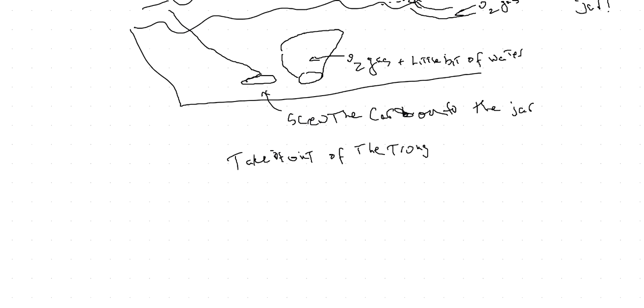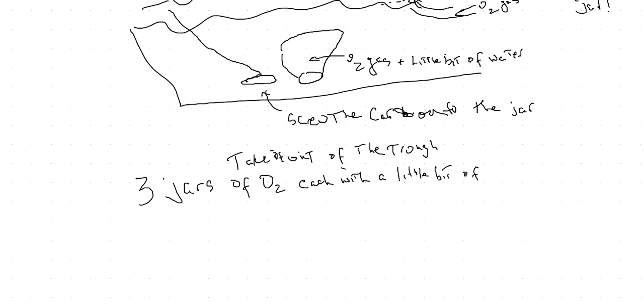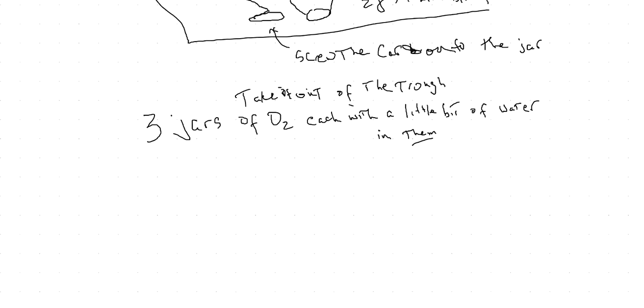And so what we end up with is 3 jars of O2, each with a little bit of water in them. Here's my jar.